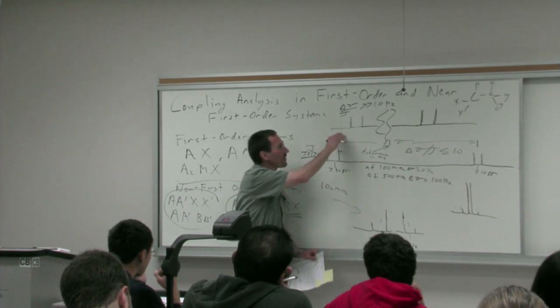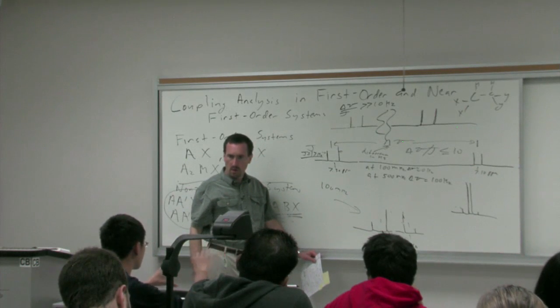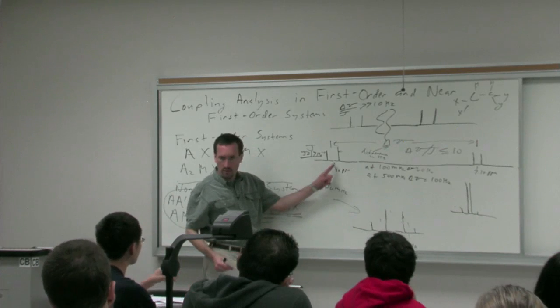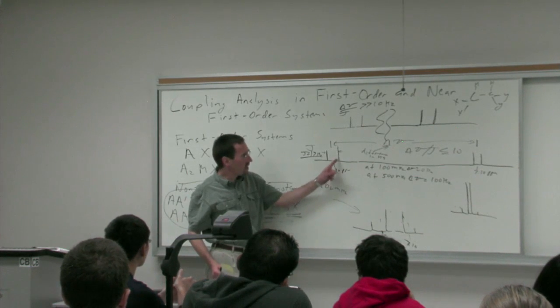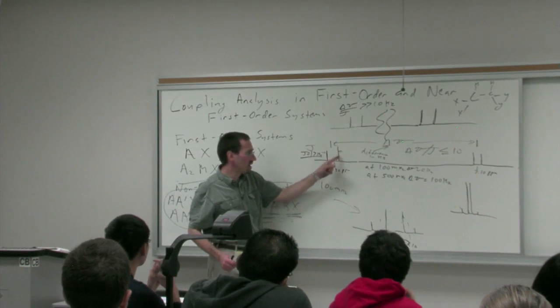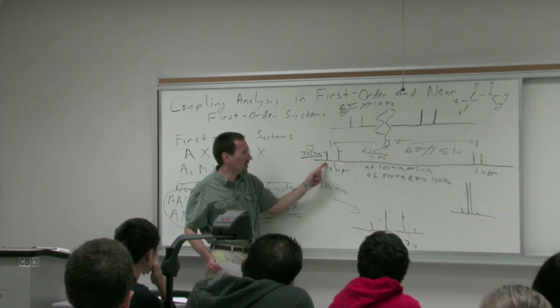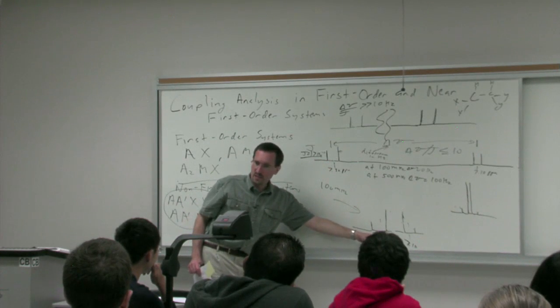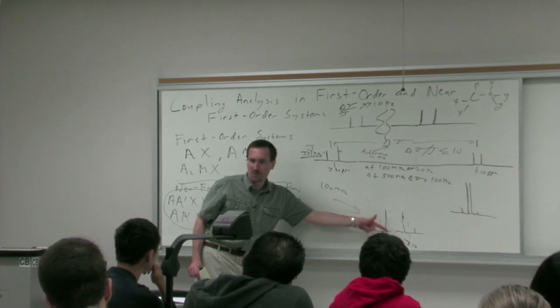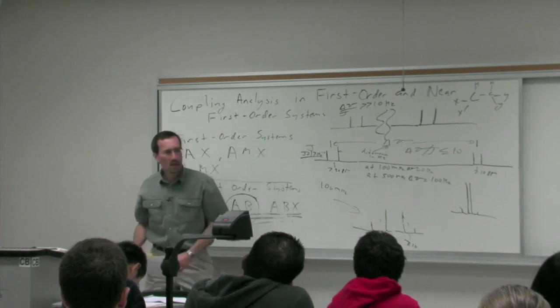And that really is the difference between the AX. The point is the center is kind of related to the ratio of the bigger and the smaller. Absolutely. Well, here the bigger one is at 7.29 ppm or 7.28 ppm, and the smaller one is at 7.31 ppm. And here we've got these two lines, and one of them is at 7.2 ppm, and the other is at whatever the number is.